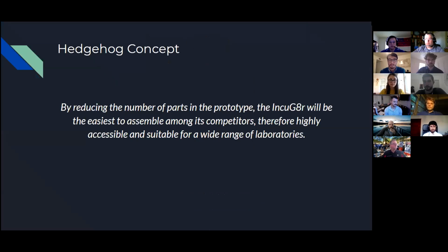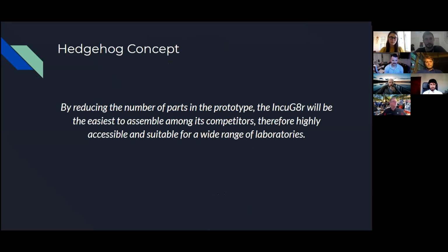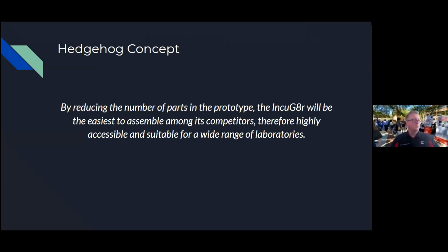Our Hedgehog concept was to design a bioreactor with the fewest parts among the competition in order to ensure accessibility and implementation in a wide variety of lab environments. An auxiliary benefit of this goal is significant cost reduction for both materials and assembly.